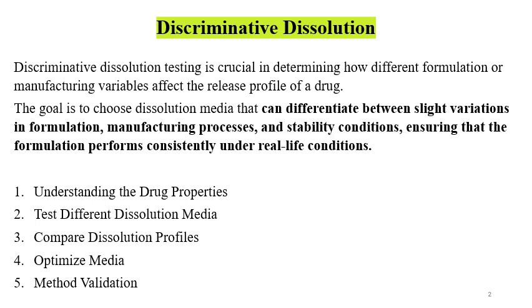The steps for development of the discriminatory dissolution method are, first, starting from the understanding of the drug properties. Test different dissolution medias, compare dissolution profiles, optimize the media, and then go for the method validation.